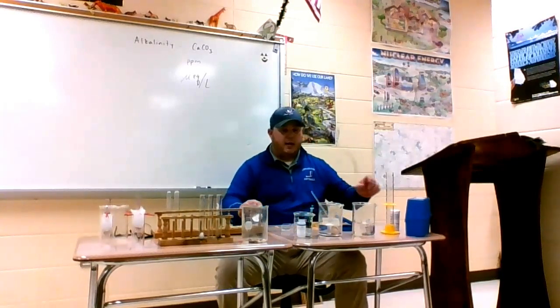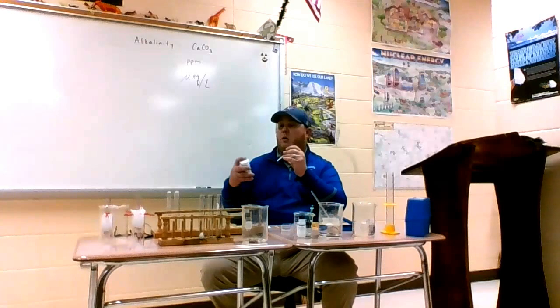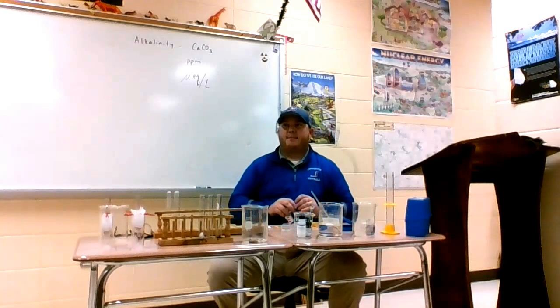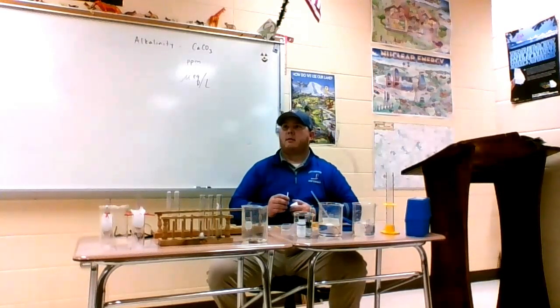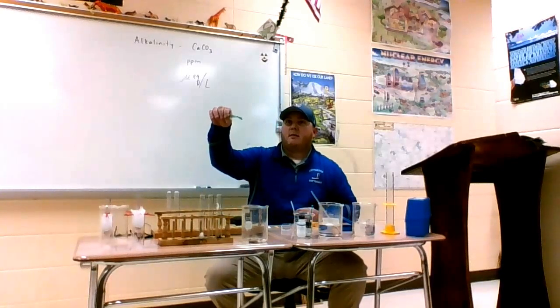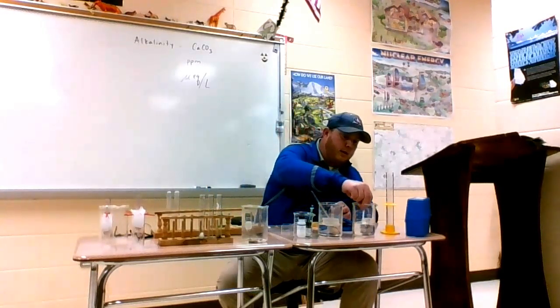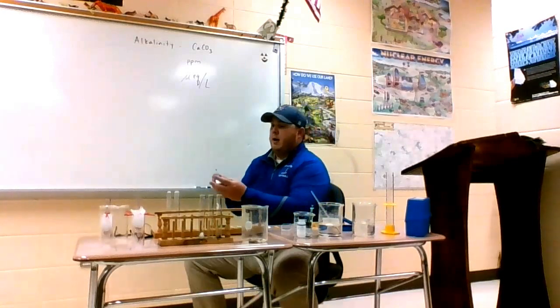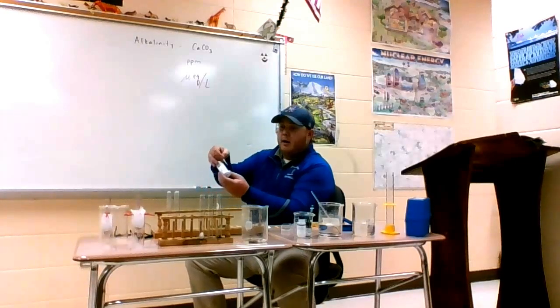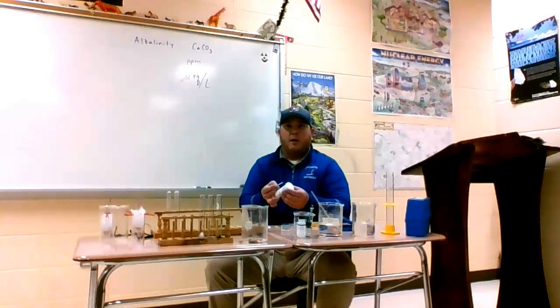So another way to do it is these pH test strips, which is a little better. This just has more indicators. Why would we do the first, imprecise one at all? Cheaper. Is that what you use in fish tanks? Yeah. It's just broader, easier, and cheaper for the consumer. Basically, this is going to tell me if it's really acidic or really basic. This one is a little bit better. I dump this in, and I can compare according to this color chart. But it's still not going to give me a great indication of the pH because it leaves a lot to interpret with the colors.